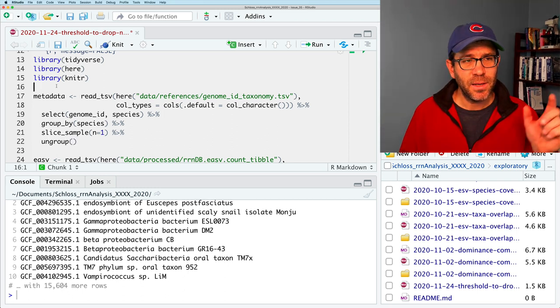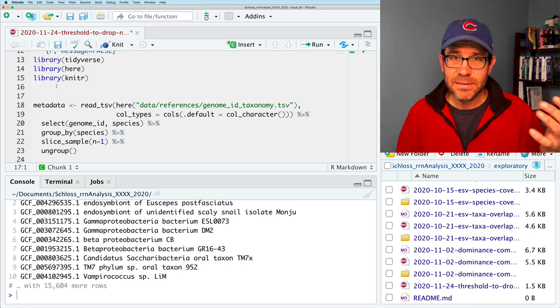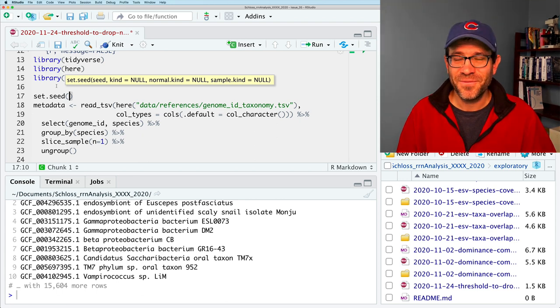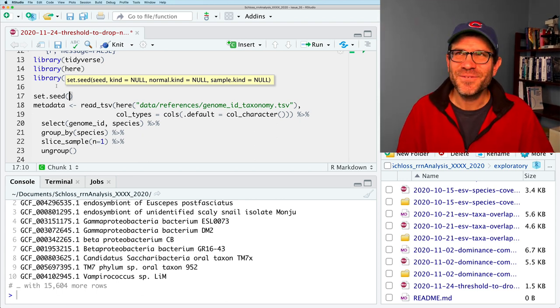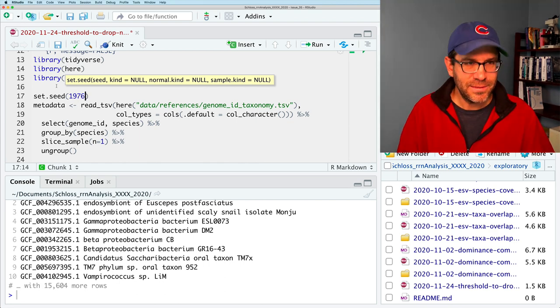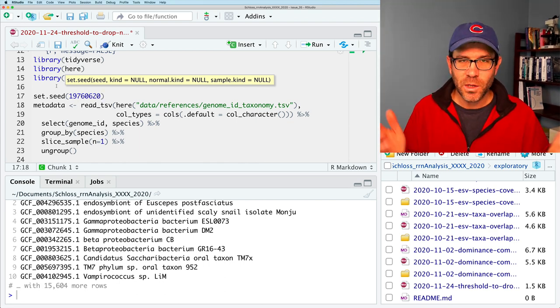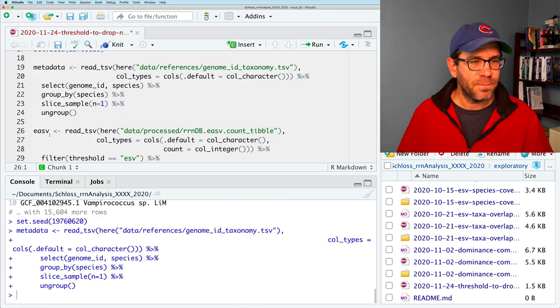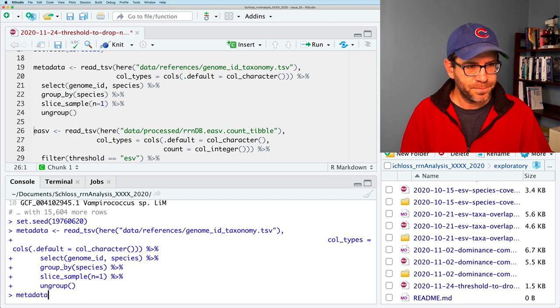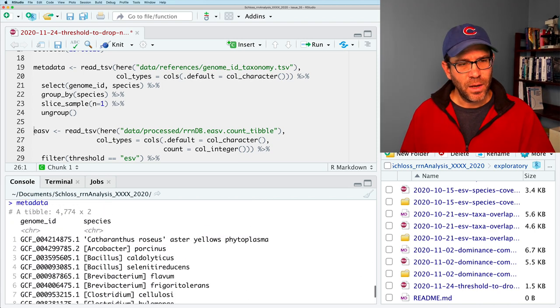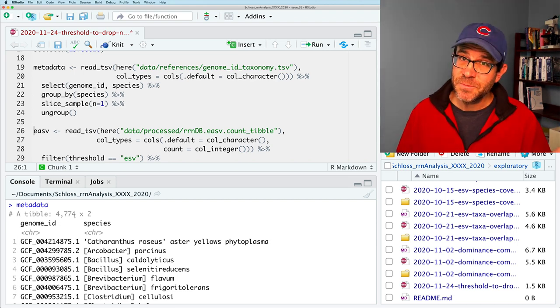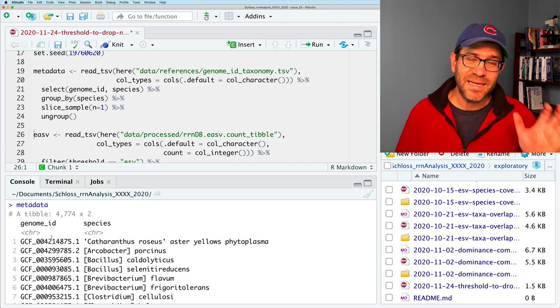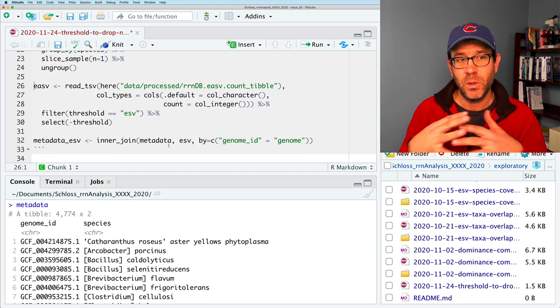This will get us our two columns. I'm going to group by species, and as we saw a few episodes ago, we can do `slice_sample(n=1)` which will give us one genome per species. We can then ungroup that. Because I'm using that random slice sample, I need to set my seed — I use my birth date, 19760620. Running that gives me 4,774 rows, which is the number of species in the data set, with genome ID and species.